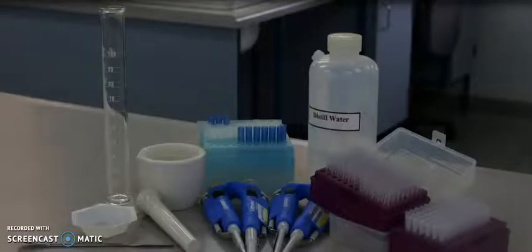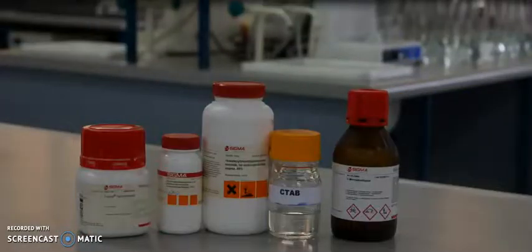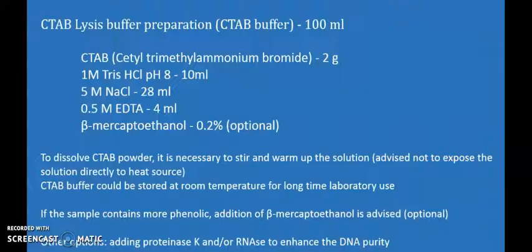We are going to see in this video an extraction of DNA from plant samples using the CTAB method. 100 ml of CTAB lysis buffer can be prepared using this description.